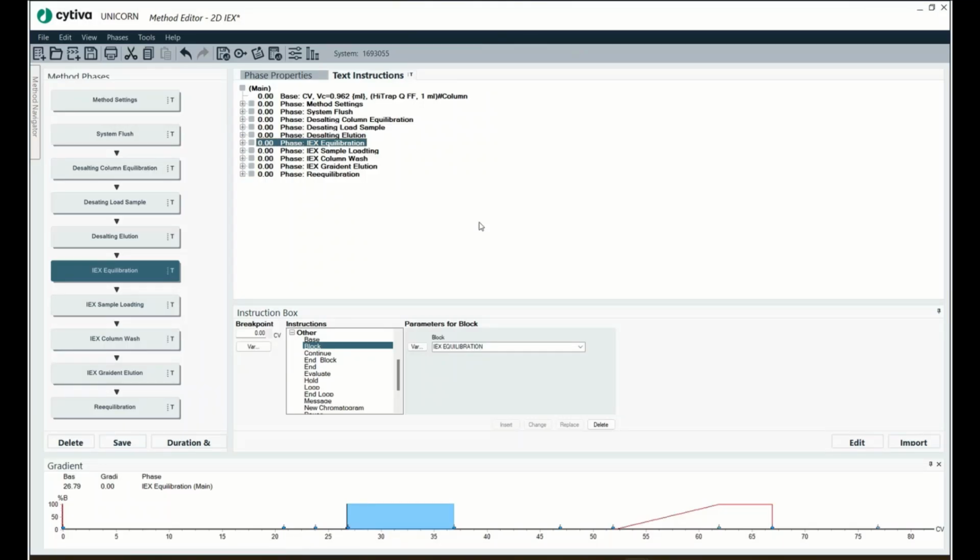All right, so I'm coming back to tell you if there are any mistakes that need to be fixed, and there are none. The method worked fine. There were some improvements, though, that I was able to make that I felt were worth showing you guys. So the first one was that originally I was planning on using 2 5 mil loops strung end to end to make a single 10 mil loop.